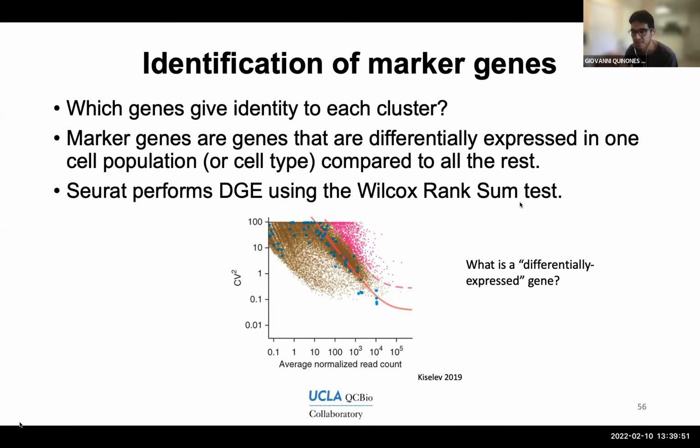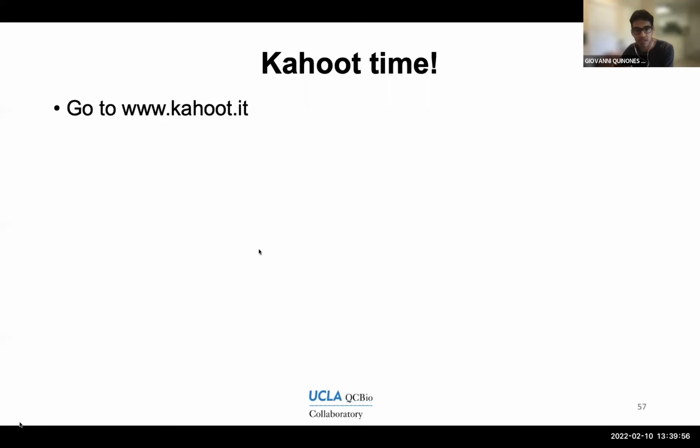Okay, so let's switch back to our R code. Nope, it's not Kahoot time yet.